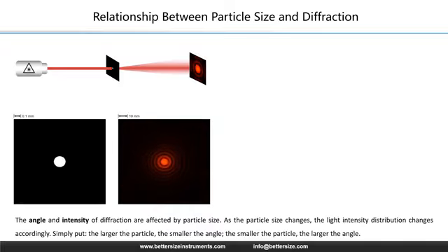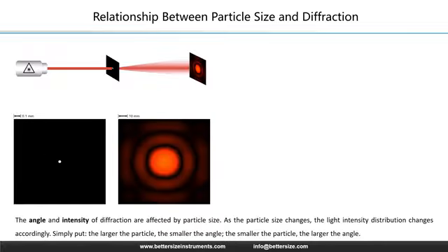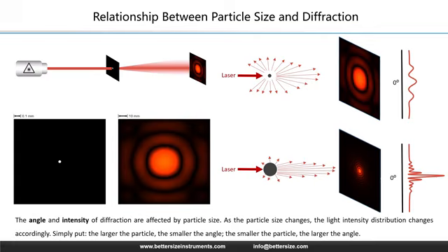Now, watch the animation carefully. As the particle changes size, the pattern breathes. You will notice a fundamental counterintuitive behavior. As the particle gets smaller, the pattern gets bigger. As the particle gets larger, the pattern gets smaller. This is the inverse relationship that drives our entire industry.